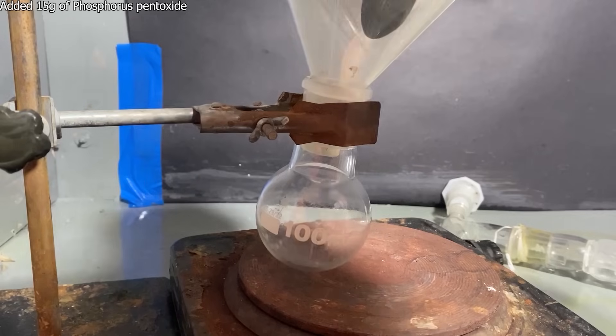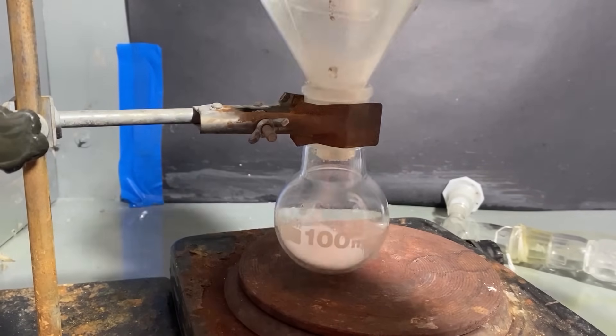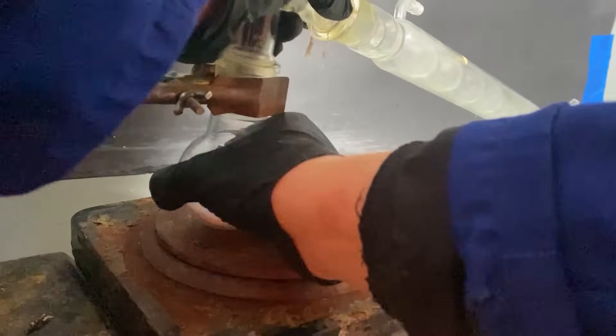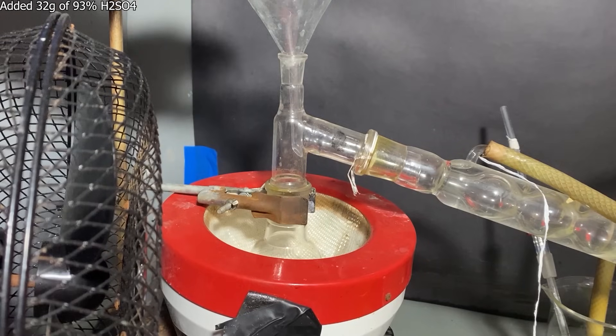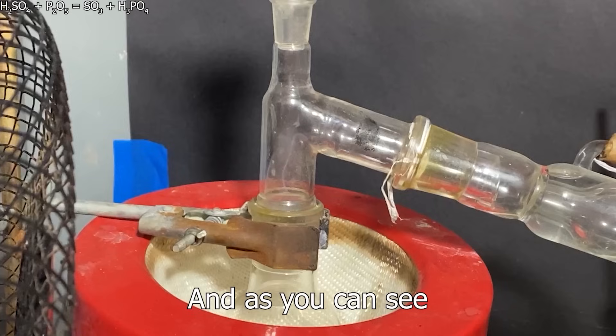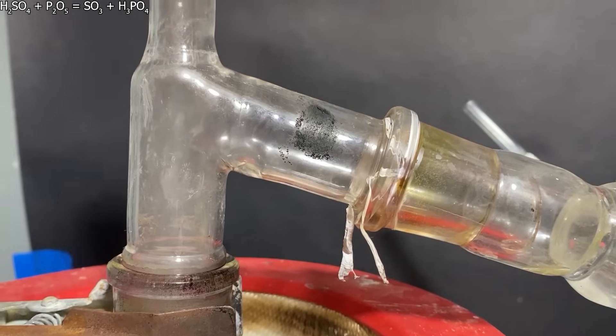To a boiling flask, I've added around 15 grams of a potent dehydrating agent called phosphorus pentoxide. Then I assembled a distillation apparatus. Finally, I added some corrosive sulfuric acid into the flask. And as you can see, a white mist of SO3 vapor is being produced — and that's our sulfur trioxide.